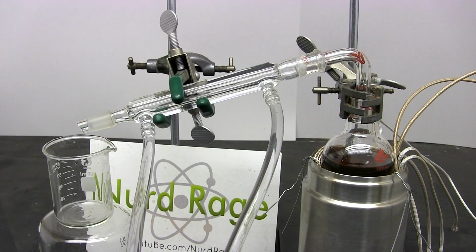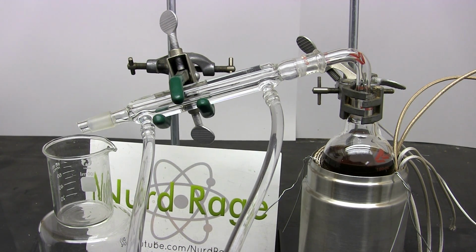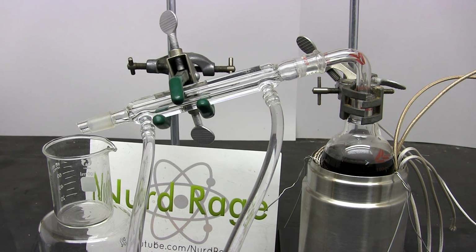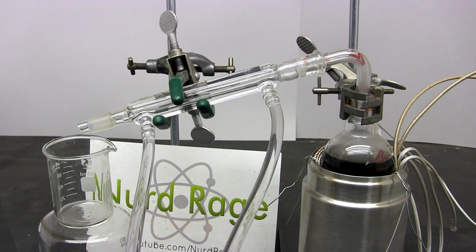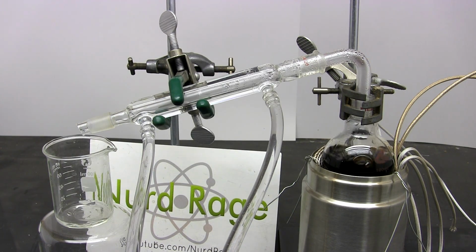Let me zoom in. First turn on the water flow and then turn on the power. Start on low power and gradually ramp it up until you can see stuff condensing. If you look closely at the acid, you can see it expanding as it heats up. This is why we only fill halfway and not completely, to allow for thermal expansion. Eventually, volatile organics and water should start condensing.